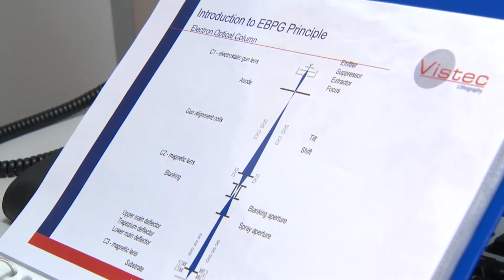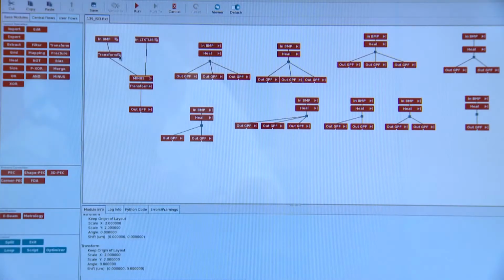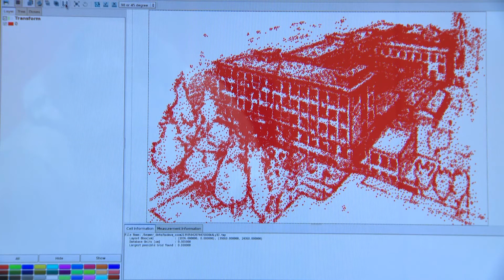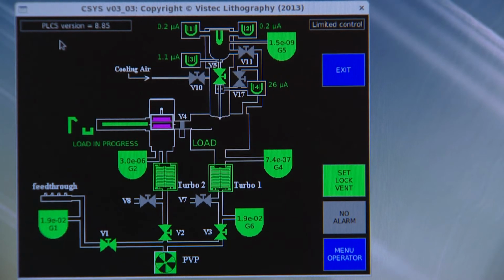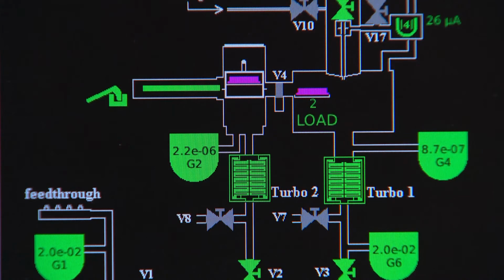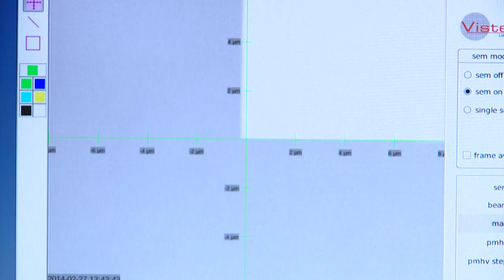The following shots show the process of preparing micro and nano structures, or to put it more precisely, exposure on the electron beam writer. Data for an electron beam writer are prepared where else? In a computer. The electron beam writer is controlled, you guessed it, by a computer.